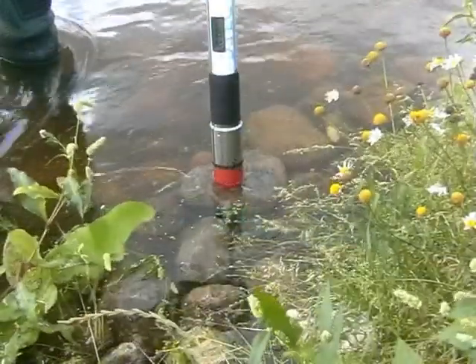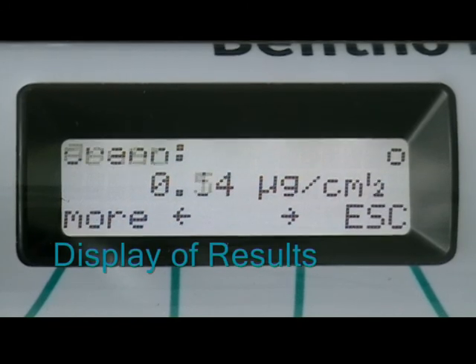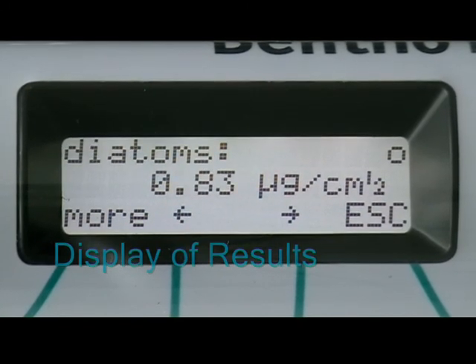The instrument is then placed firmly on the substrate to be measured. The results are shown immediately on the display. The measurement results are displayed in sequence.